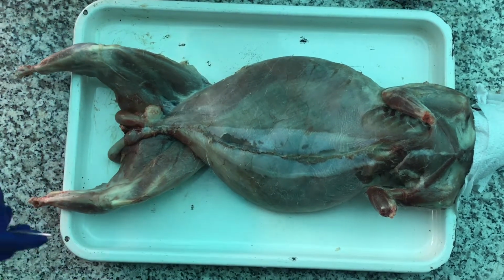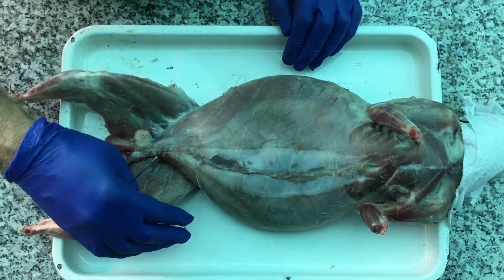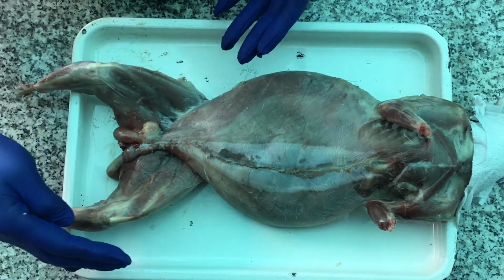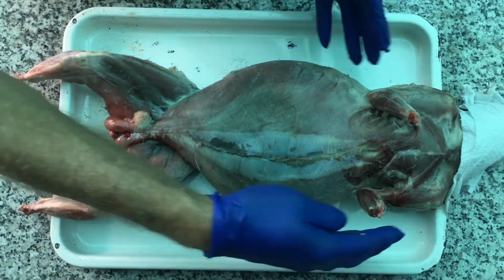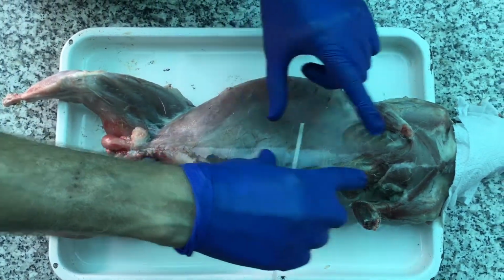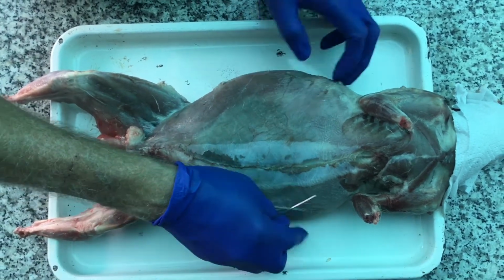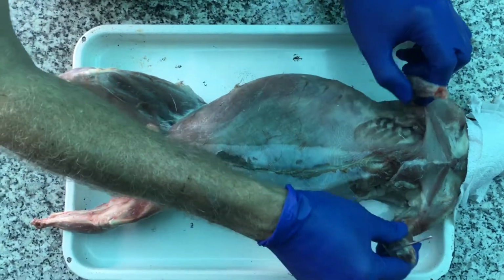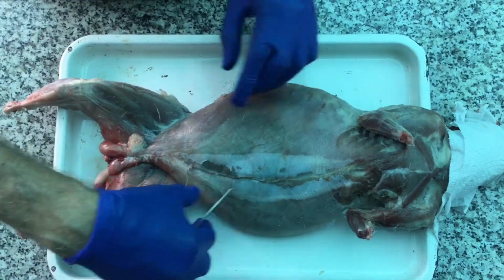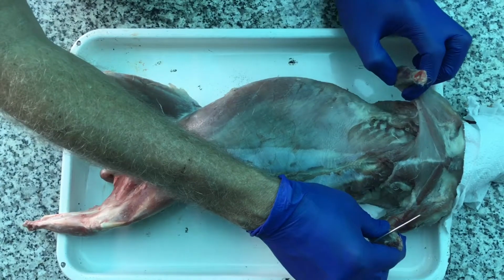All right, so what we've got here is our freshly slaughtered and skinned rabbit, which we're going to use as a model for that basic organizational plan of really any mammalian body, including, of course, a human. And what we're looking at is that outer tube of the body, the trunk from the pelvic region, the abdominal, the chest region, or what we call the muscle, skin, and bones part of the body that wraps around the outside. The limbs are nothing more than muscle, skin, and bone projections out from that outer tube of the body, both the lower and upper limbs, or hind limbs and forelimbs on the rabbit.